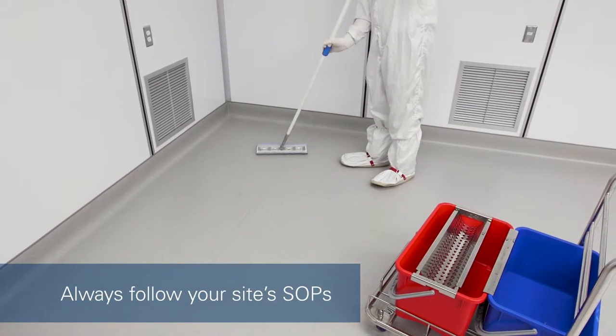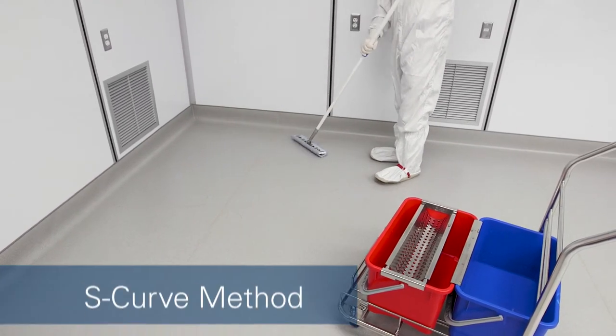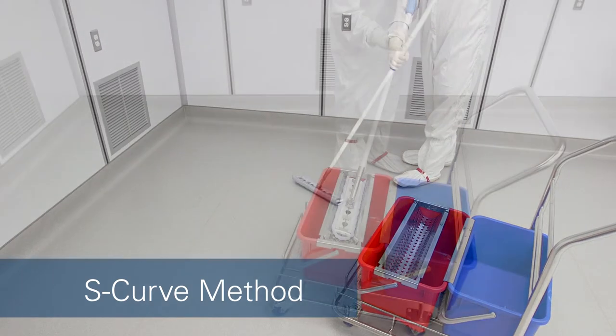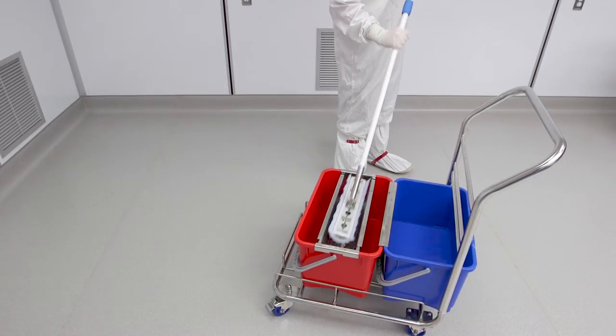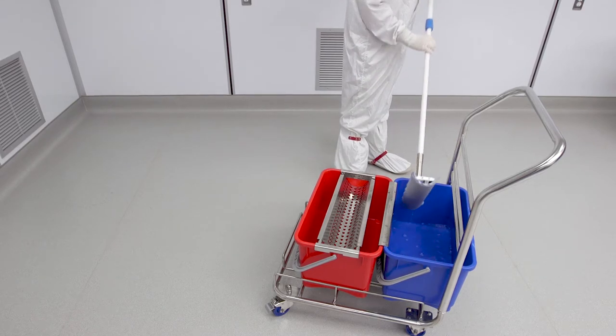The S-curve and place and pull. Mop in an S-shaped pattern covering about one square meter of floor area at a time. Ring completely into the waste bucket. Wet the mop head with the cleaning solution and repeat the cycle.